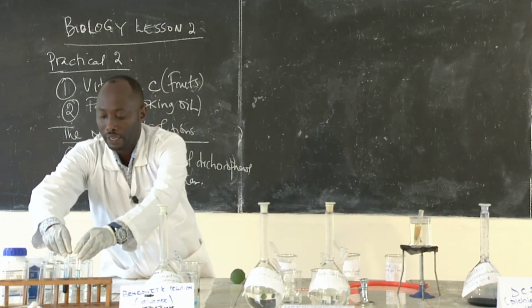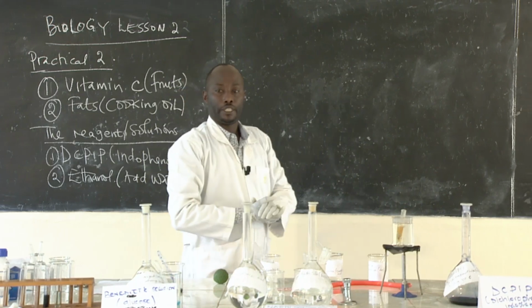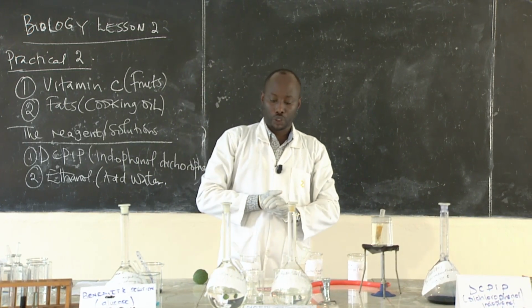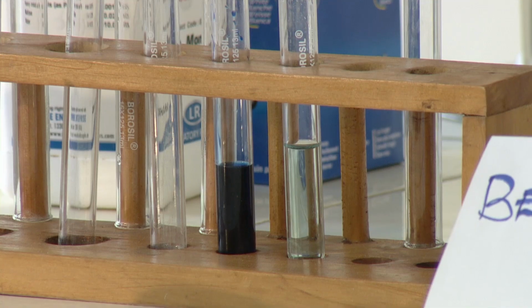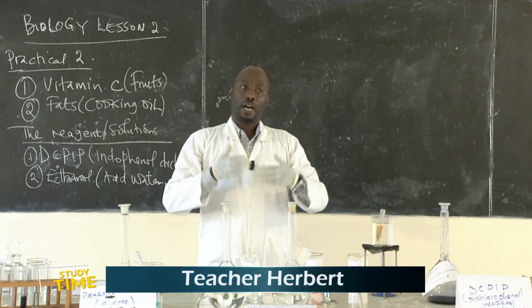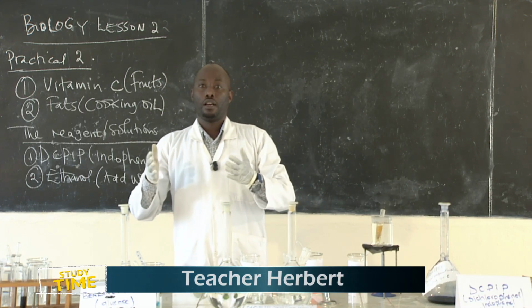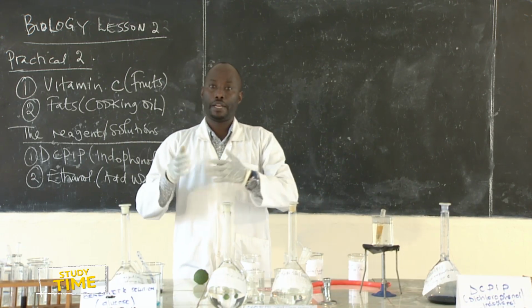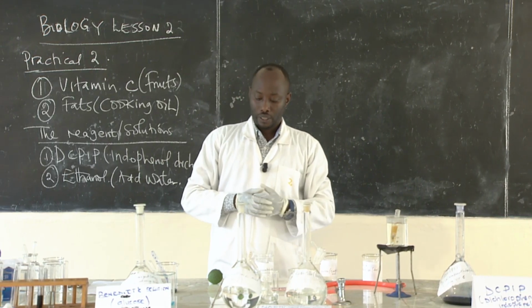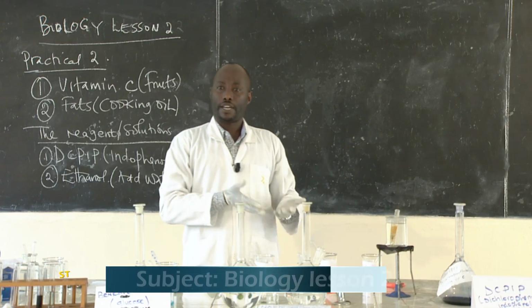Thank you. Let us go to the next experiment, which is concerning sample testing of cooking oil. I told you we use cooking oil very much in our kitchen to prepare different foods. I'm going to test, can we say that the cooking oil contains fats?